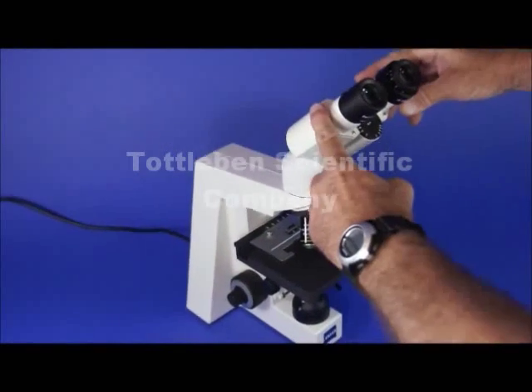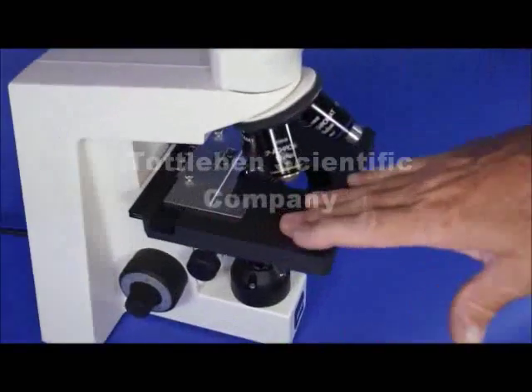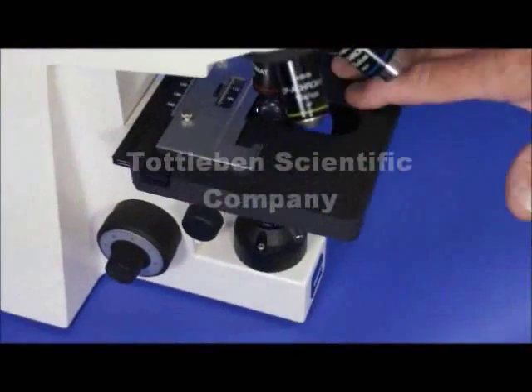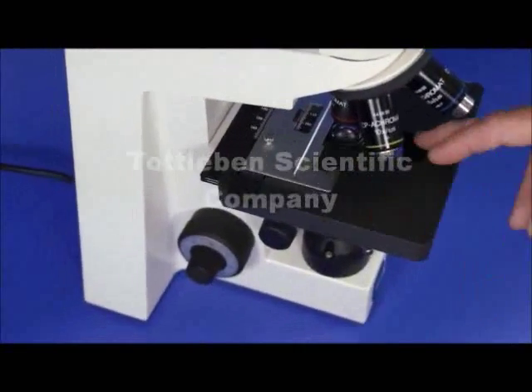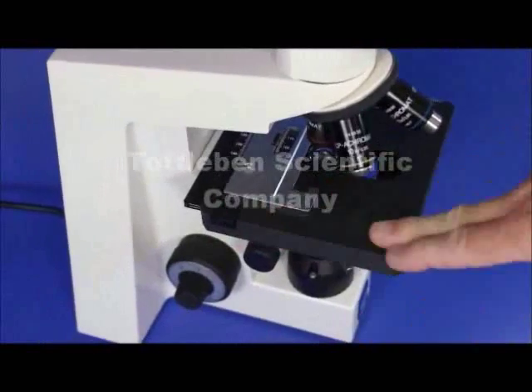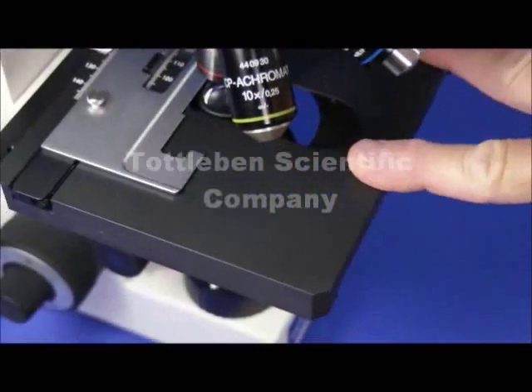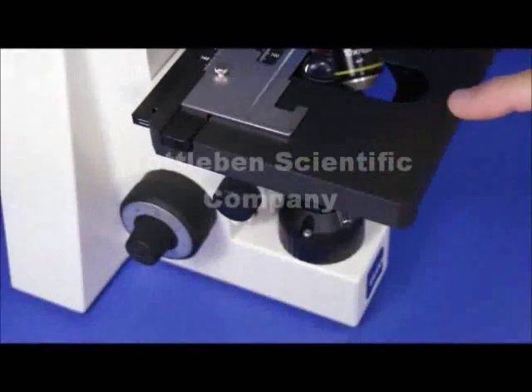Another nice thing about this scope is the stage — it's a ceramic stage, not a regular metal stage like most. Ceramic stages cost a lot more because they never wear out. You don't see gouge marks, tears, or paint rubbing off. This stage will last forever — it's basically mar-free, scratch-free, oil-free, and chemical resistant. Very nice stage.